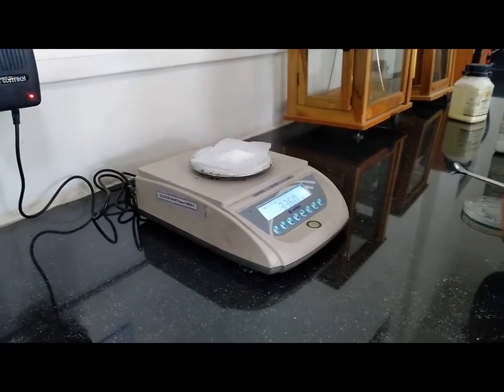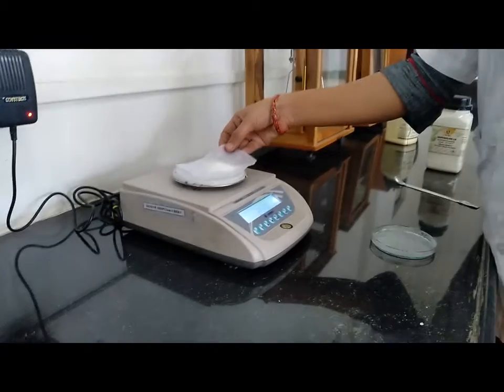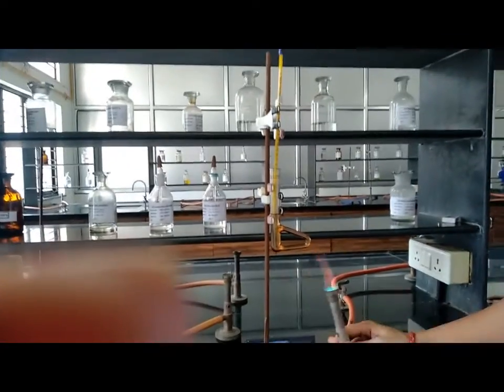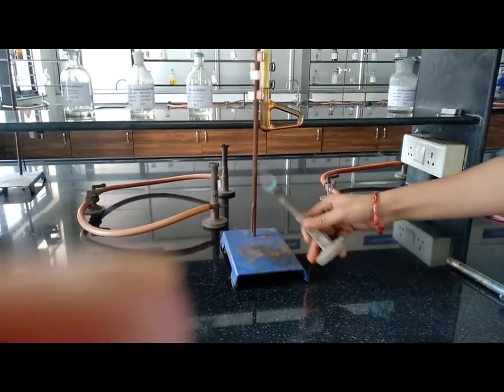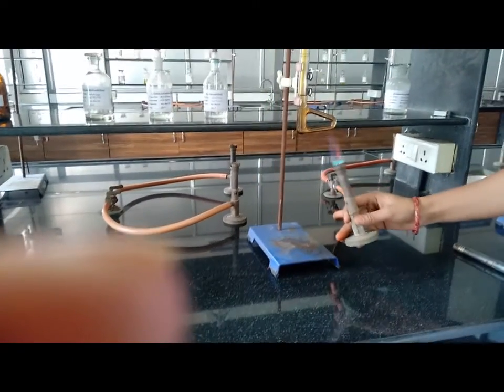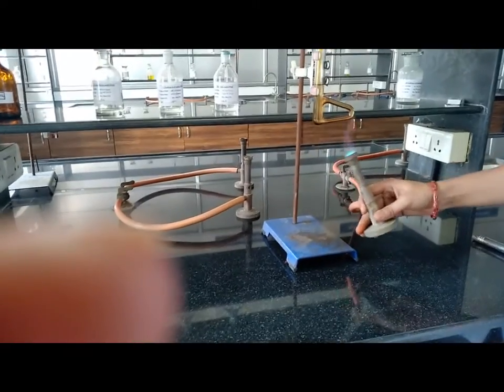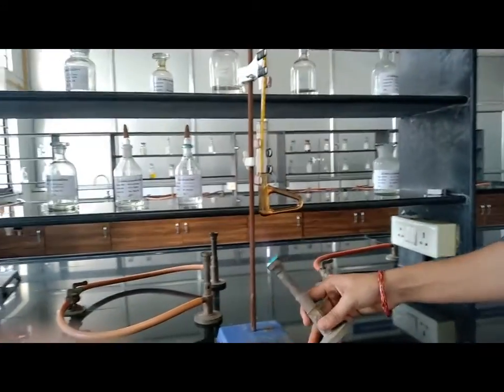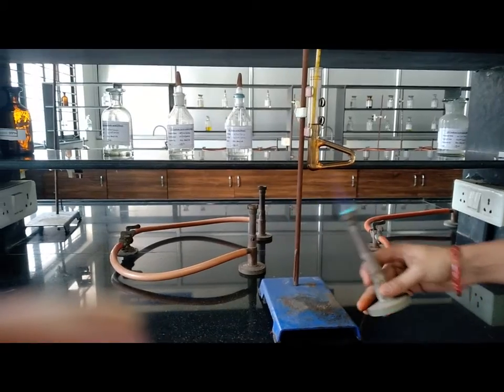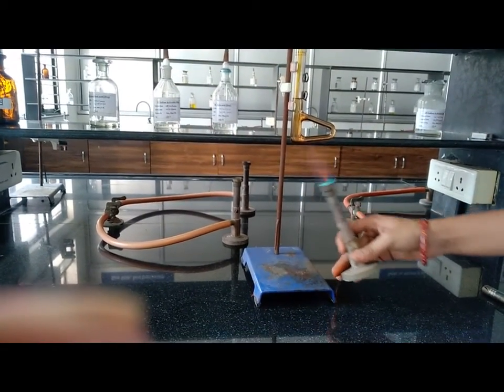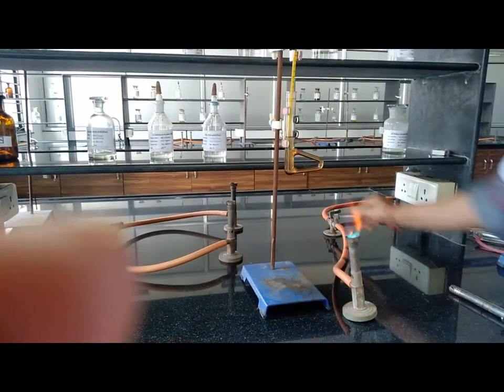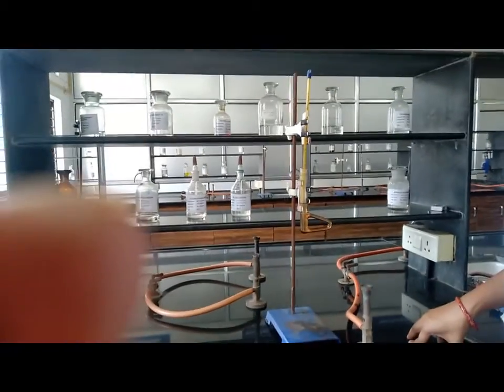We have to perform melting point determination. The melting point of the given synthesized product is determined by using the melting point determination method. After solid particles get converted into liquid, we have to stop the heating and record the melting point. Now solid particles almost converted into liquid, stop the heating. The melting point is 78 degrees Celsius.